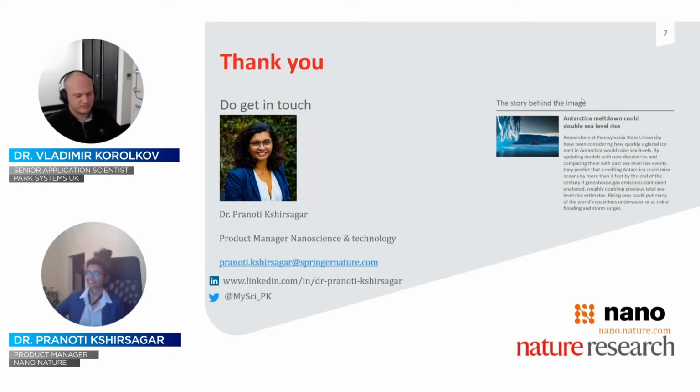Absolutely. Yeah, thanks. Great, thank you both. Pranoti, another question for you. How detailed are the summaries on the Nano platform?